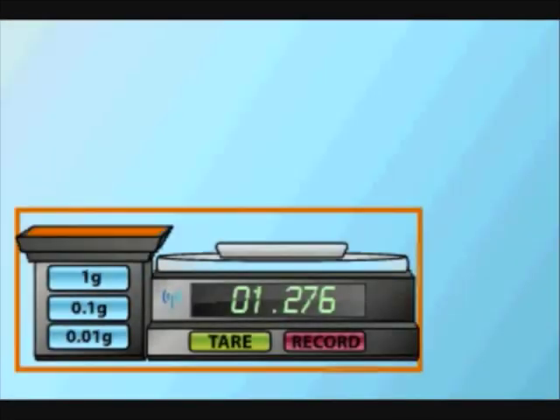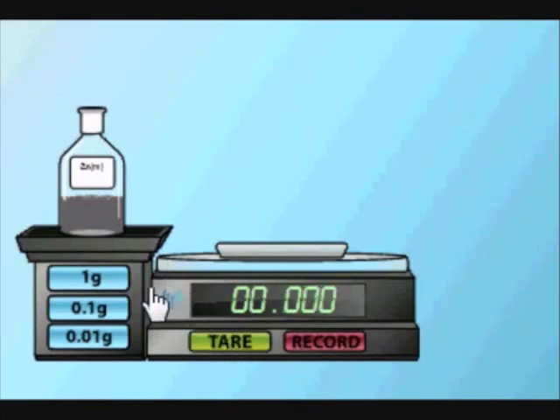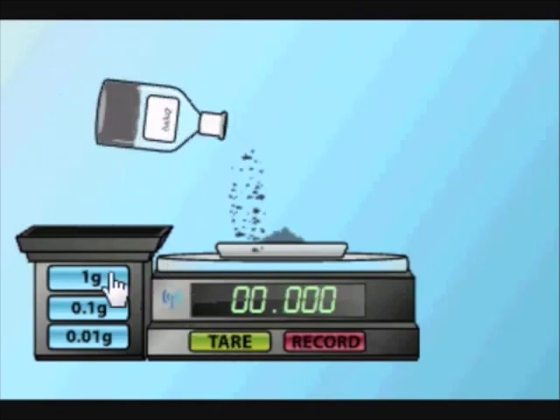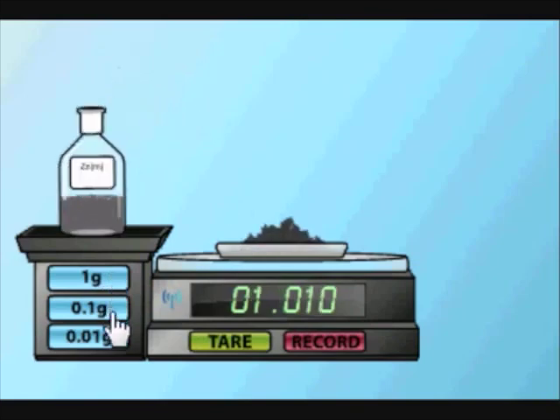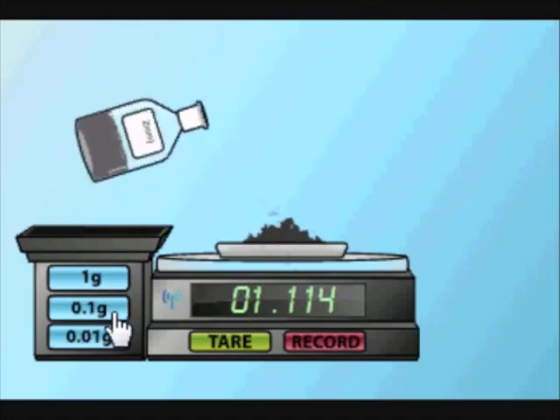OSU Chemistry eCampus uses online chem labs, a virtual chemistry lab program produced by online labs and accessed entirely via the internet. These interactive labs include animated functioning lab equipment.